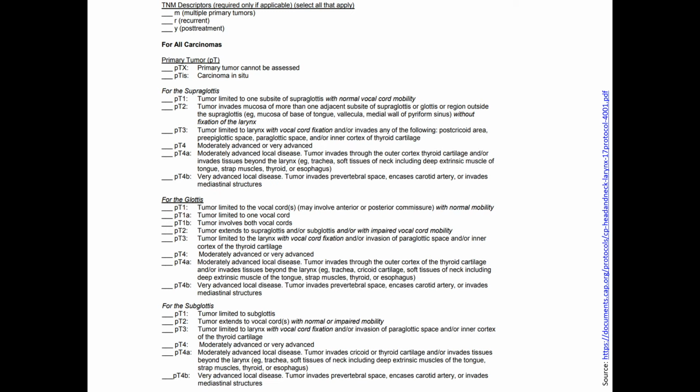Here the examples I've seen have been maybe 2 or 3 rings of trachea so far. If I get a good section of that, it's certainly the tracheal margin you guys will take, but if I get a good section of random trachea, that's fine too. But if you don't see anything grossly, I'm happy to take your gross impression. I don't really need that sample.